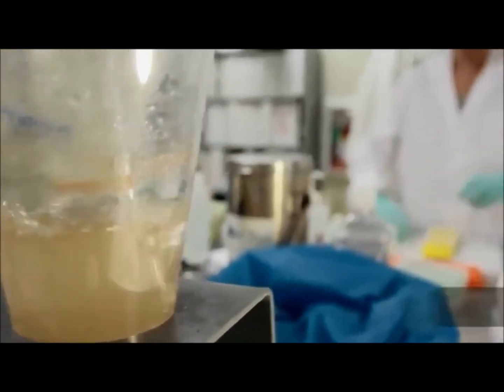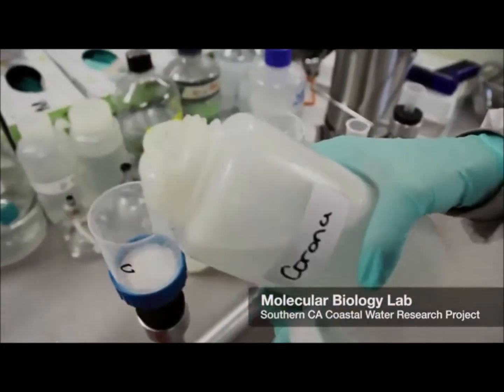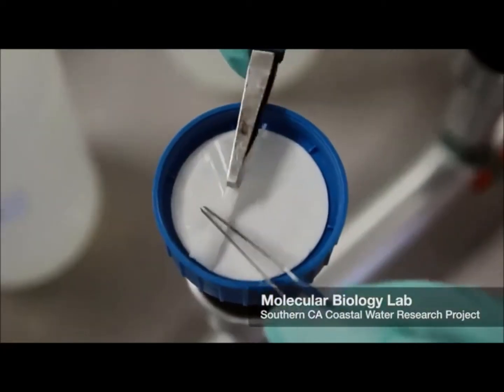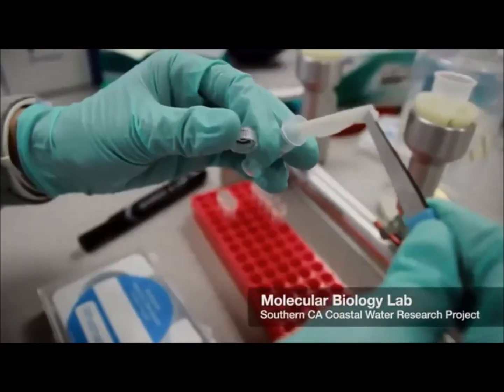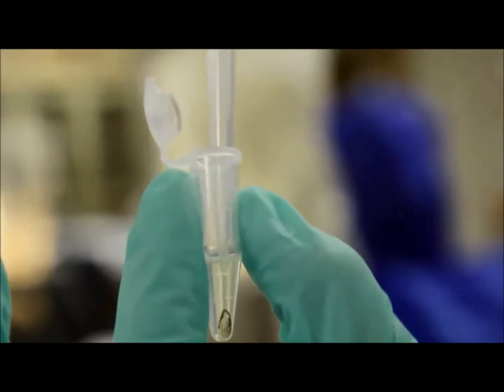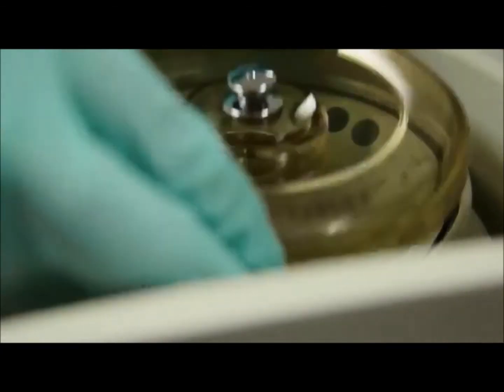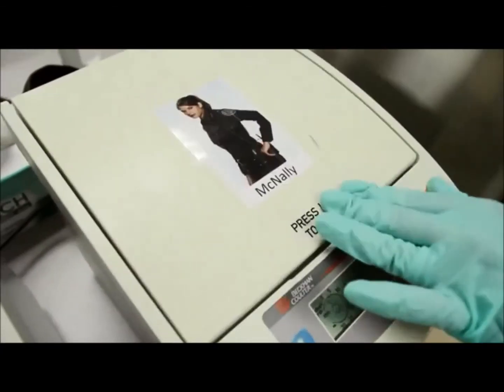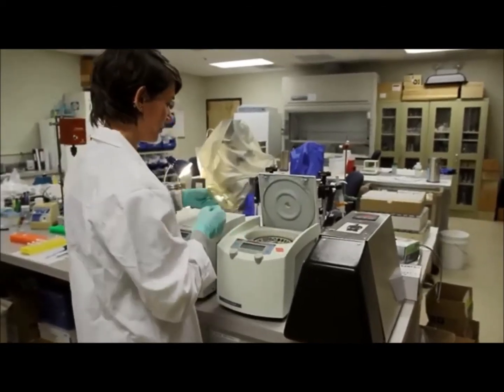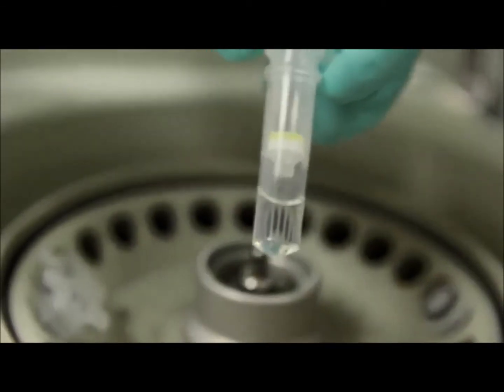So what we usually do is we take water samples from the beach, storm drain or creek. We bring it back to the lab, we filter them to capture all the microorganisms on the filter. Then we extract DNA from the filters. Now the genetic material from the filter will be available for quantification by qPCR or digital PCR.